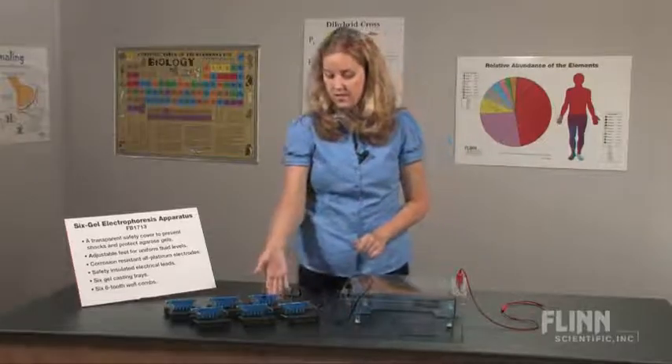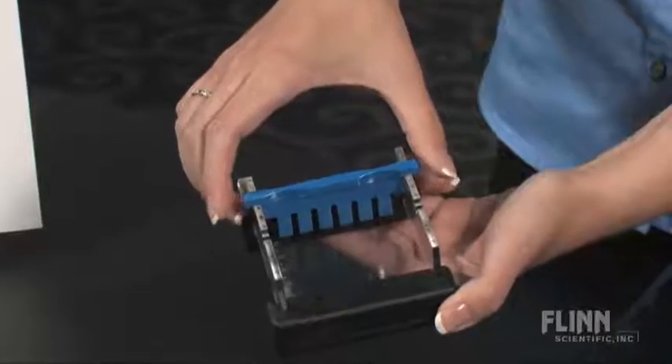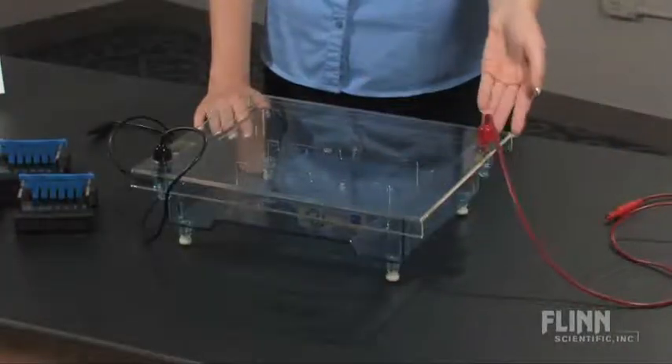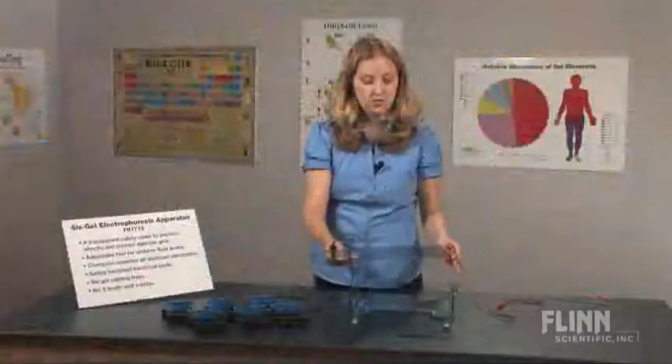It comes with six gel casting trays, and each gel casting tray comes with a six-tooth well comb. It also has safety insulated electrical leads and features corrosion resistant all-platinum electrodes.